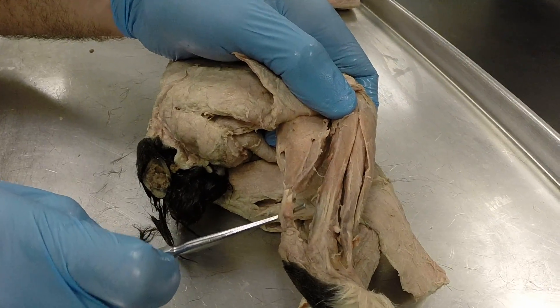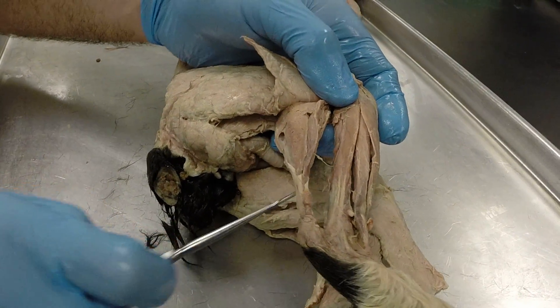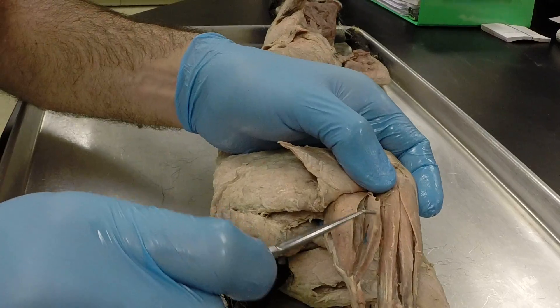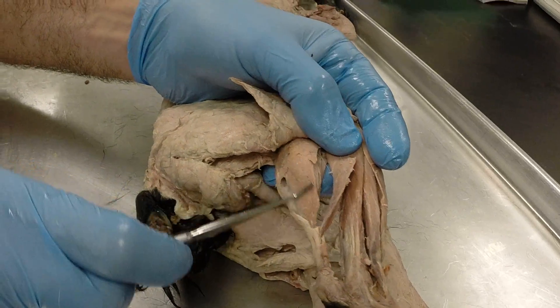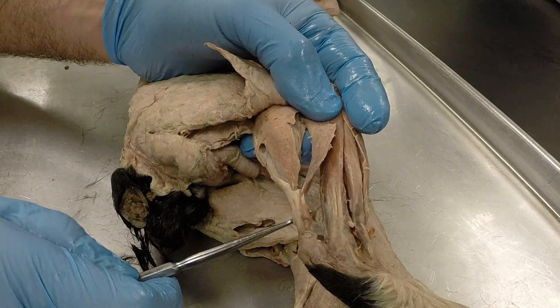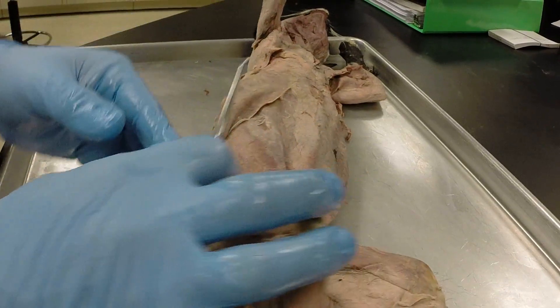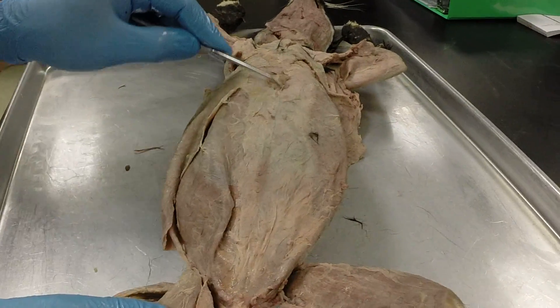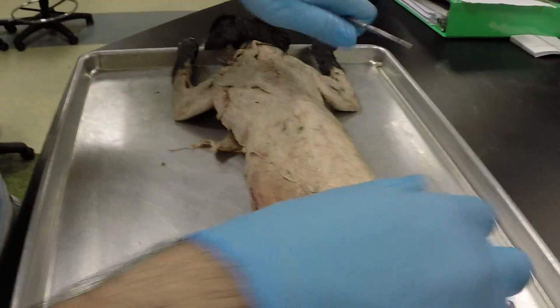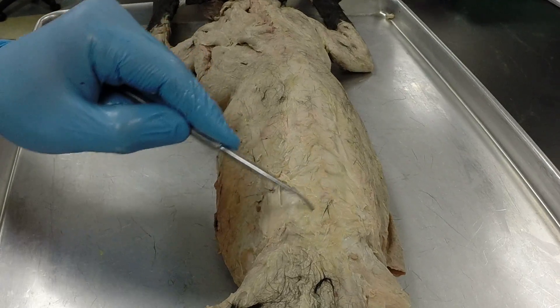Then you have the tendocalcaneus, another piece of connective tissue you need to know. Connected to it are two muscles: the soleus and the larger gastrocnemius, the calf muscle. Along with the tendocalcaneus and the fasciolata, you also need to know the linea alba — the white line of connective tissue on the ventral side — and the lumbodorsal fascia, which is a diamond-shaped region on the back.